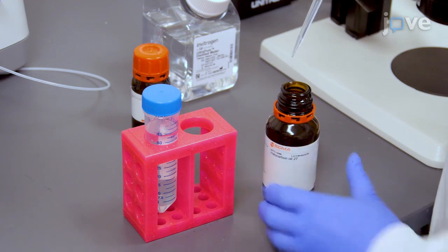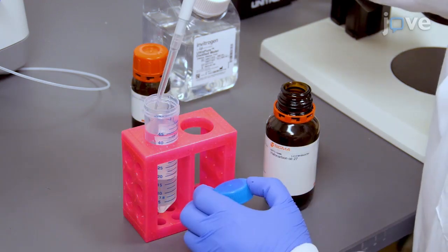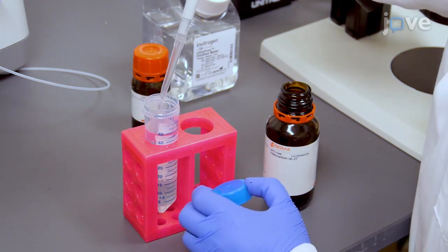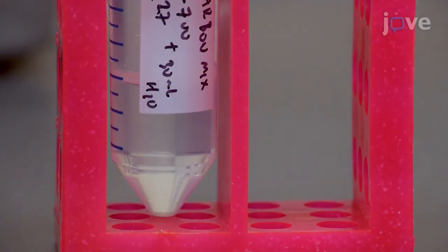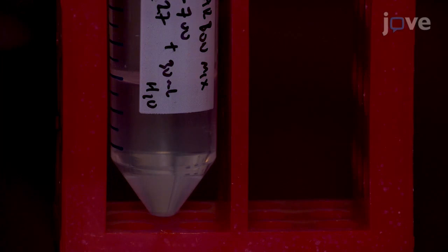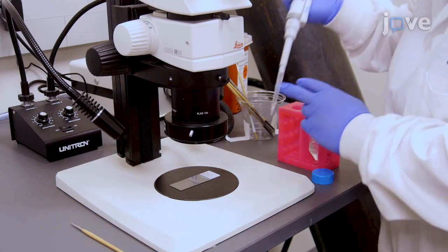Prepare the halocarbon mix by gently mixing halocarbon reagents with water and incubating the mixture at 25 degrees Celsius overnight. Cover aligned eggs with the halocarbon oil mixture.